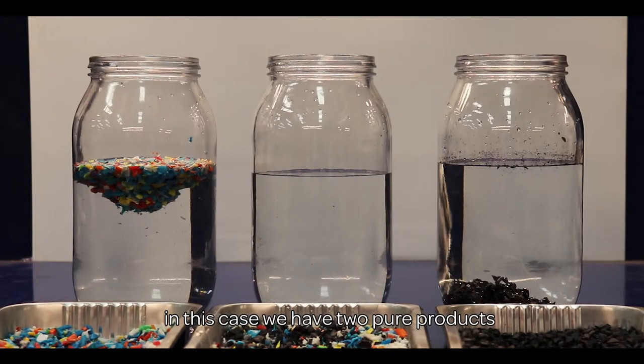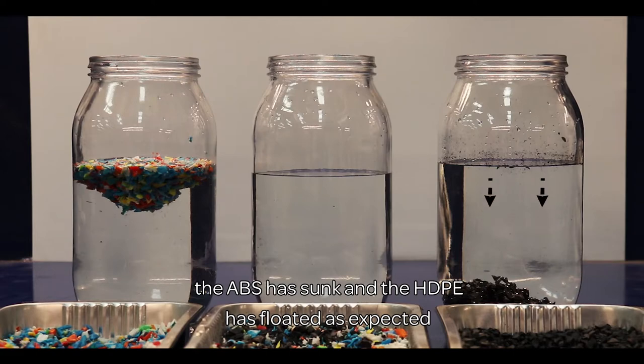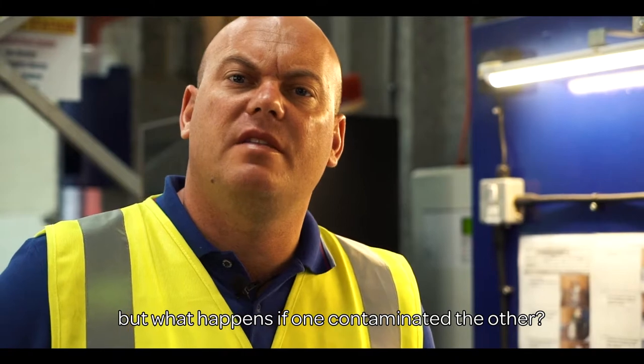In this case we have two pure products — the ABS has sunk and the HDPE has floated as expected. But what happens if one contaminated the other?